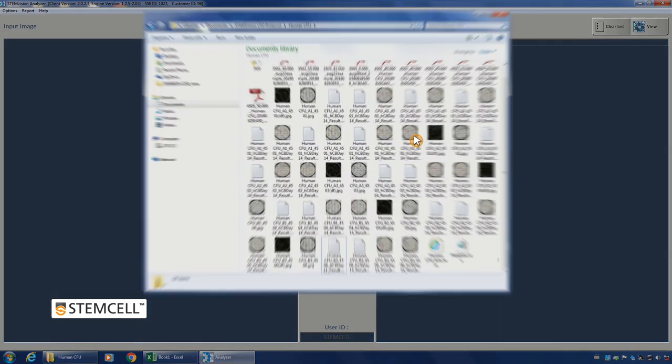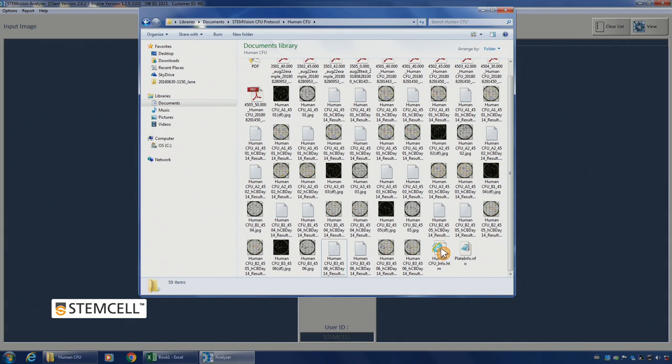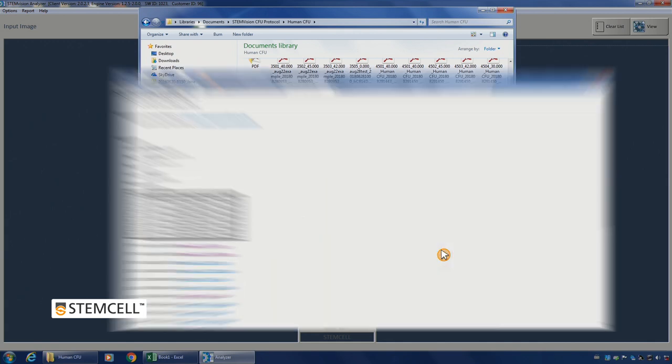Finally, you can choose to view detailed results for individual images in the analysis results file saved in the image folder. All results files for a single plate can be accessed from the info.htm file in the image folder.